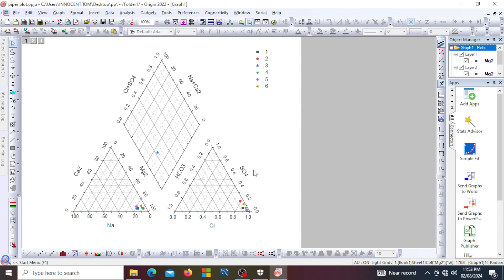Typically your Piper plot displays ion concentrations in milliequivalents per liter on a trilinear plot. It displays your cations — the positively charged ions — on the left bottom triangular corner, where you have sodium, calcium, and magnesium. You then have the triangle for your anions, where you have chloride, sulfate, and bicarbonate.